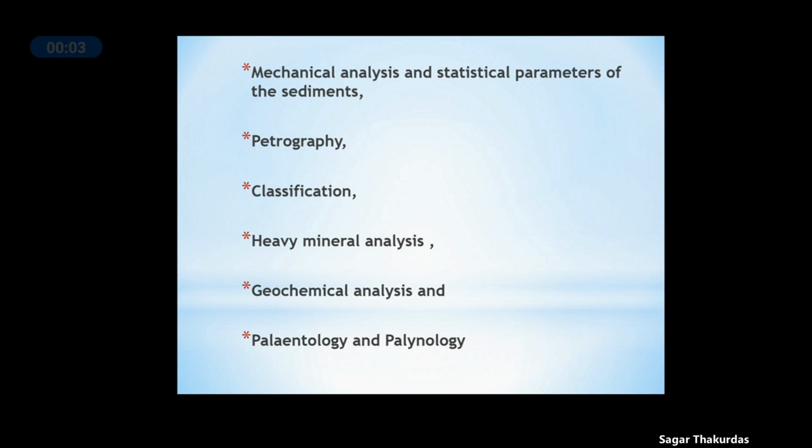So when we go for laboratory analysis, it involves a stepwise approach. First thing is mechanical analysis or understanding the statistical parameters of the sediment. This is nothing but sieve analysis, where we use sieves of different mesh size to separate the unconsolidated sediments based on their grain size, roundness, sphericity, and we can find out the skewness, kurtosis, standard deviation, different parameters which can help us in differentiating different sediments statistically.